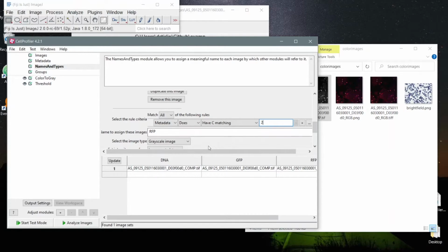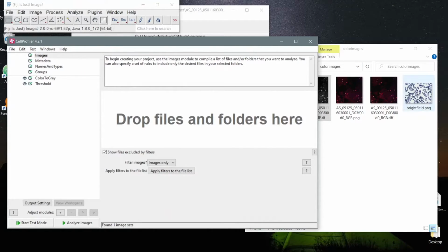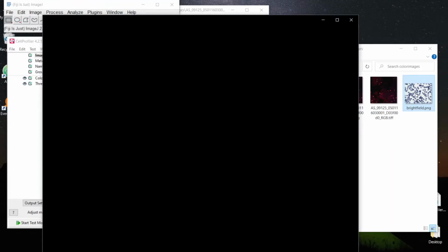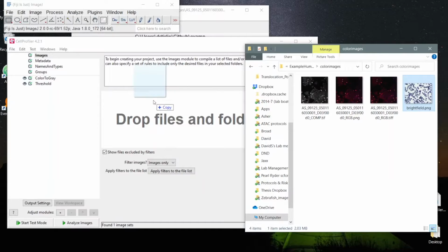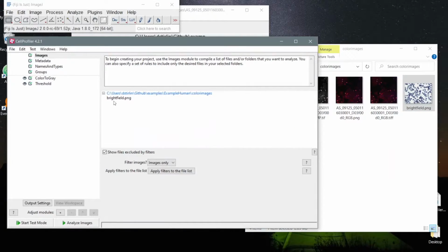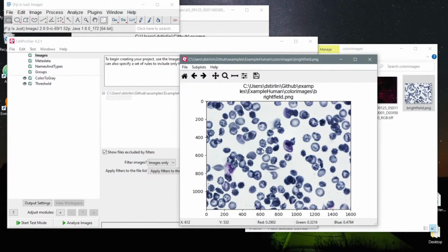Now there's one more scenario I would like to show here, and that would be if you're working with an image like this one here. Now this is a bright field image which has been stained by immunohistochemistry, and again, we can open this in CellProfiler just fine, but this isn't really a channel-based stain. There's not like a red, a green, and a blue component operating individually. They're all mixed together because it's actually just a raw color image. And the Color to Gray module wouldn't necessarily split that very well.